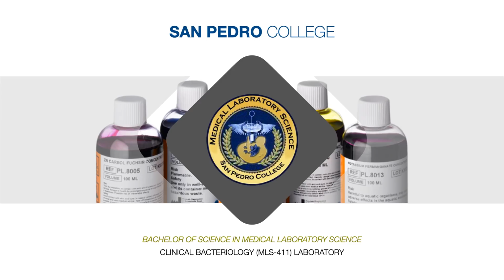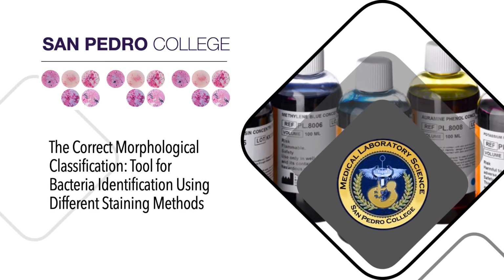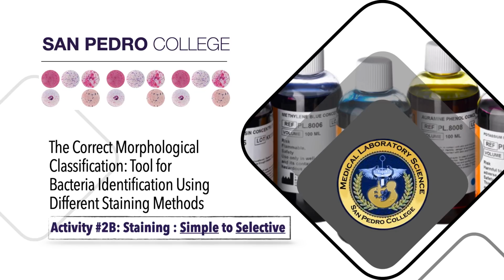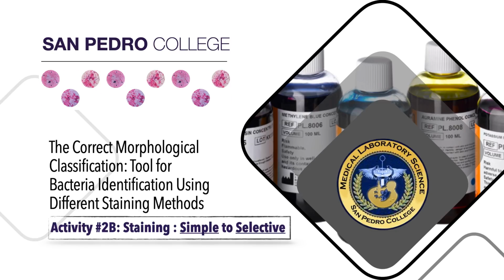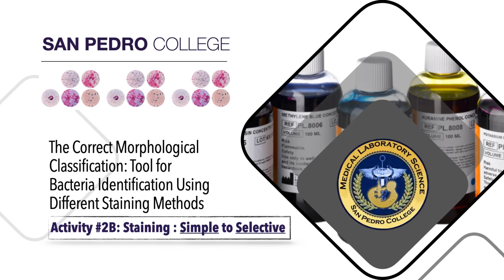Okay? Now, welcome to the second part of this lesson, and that is on simple to selective staining. The vast majority of individual bacterial cells are nearly completely transparent or colorless.